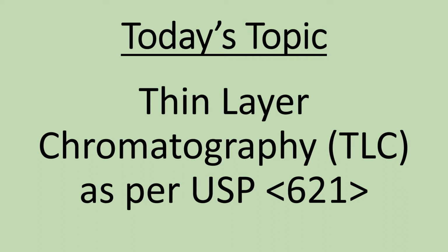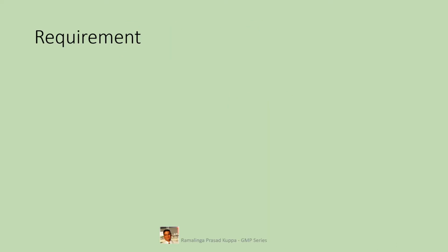Today's topic is features of thin layer chromatography, that is TLC, as per USP chapter 621. Let us see the requirement.